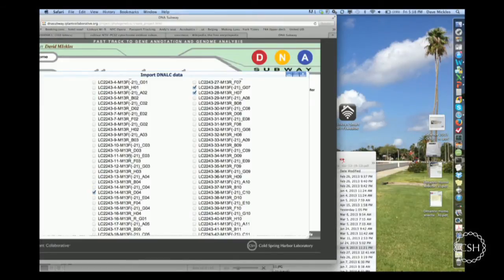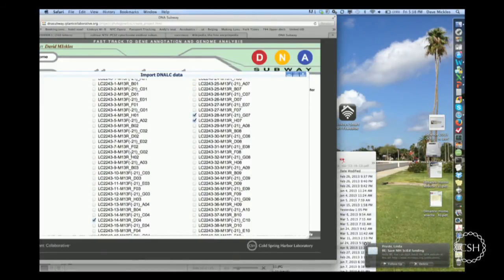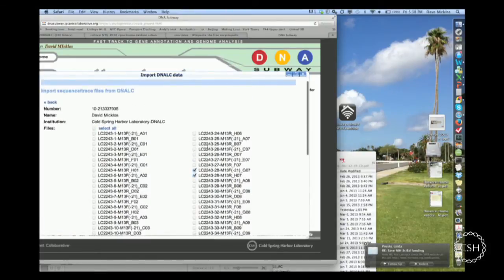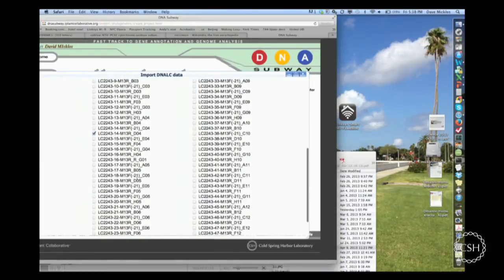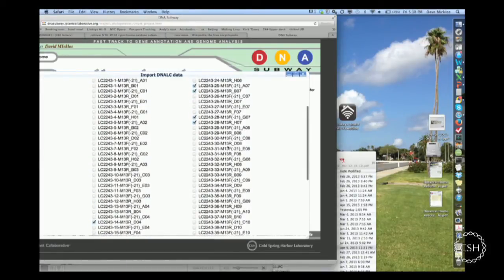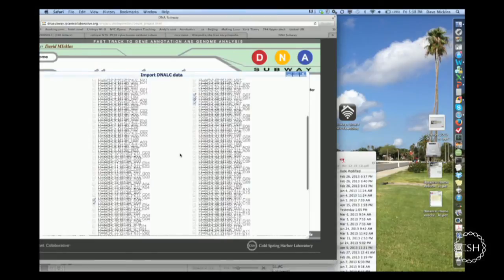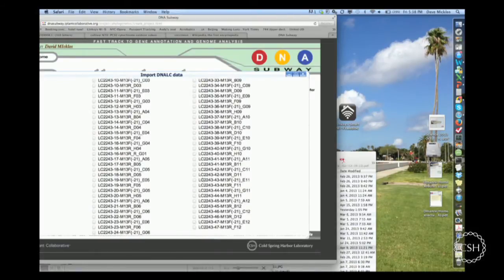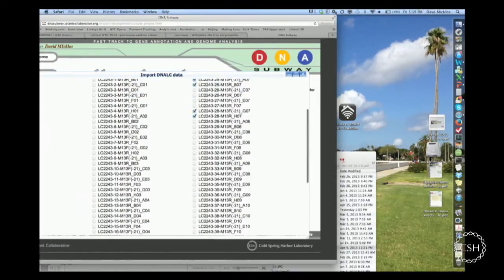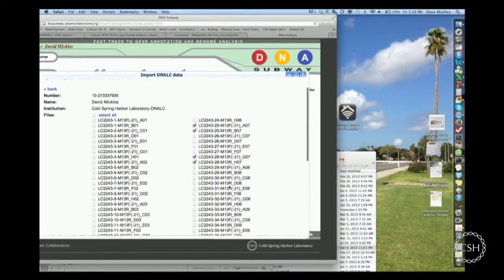That's a different one. 43, 25. Forward and reverse, and 28, the dragonfly. Oh, I've done that. So I've got them: 25, 28, and 43. Okay, so I have the three samples that I'd like to look at, 2 plants and 1 dragonfly.